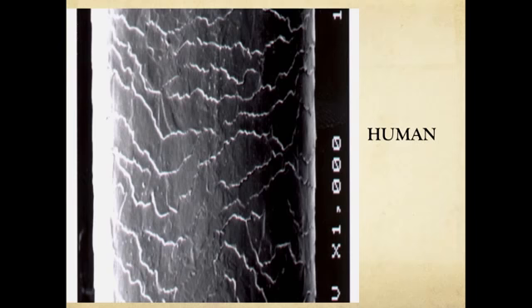This is a human hair under the ProScope microscope. You can just make out the cuticle pattern here. If you put the human hair under a scanning electron microscope, the imbricate pattern comes out very clearly.